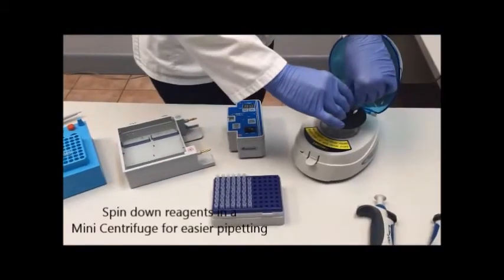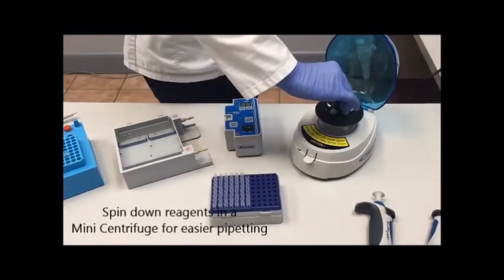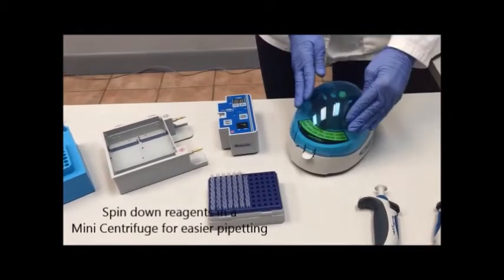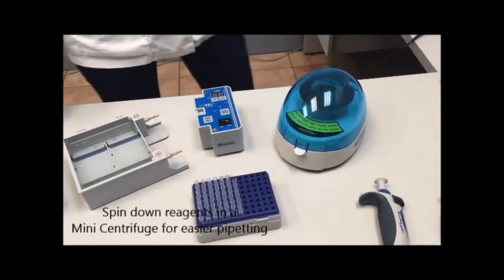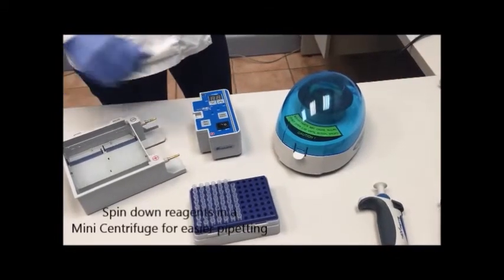The next step is to prepare the reagents. First, we spin them down in a mini centrifuge. This brings all of the reagents to the bottom of the tubes for easier pipetting.